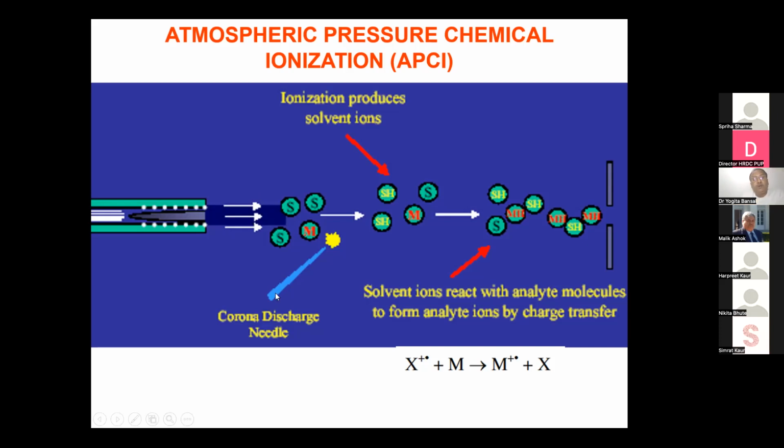Now your molecules get ionized. They react with the solvent mobile phase, and the molecule is then ionized.